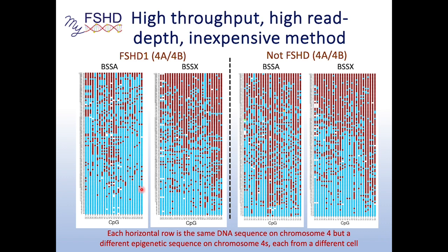Identical twins are different. This is the kind of data you get from the next-gen sequencing data when you assay it correctly. This is that 50% mark, and you see your 50% FSHD, 50% healthy, right here. It's really a second quartile mark. Very clear that we're just assaying at this point. You get the non-FSHD versus FSHD.